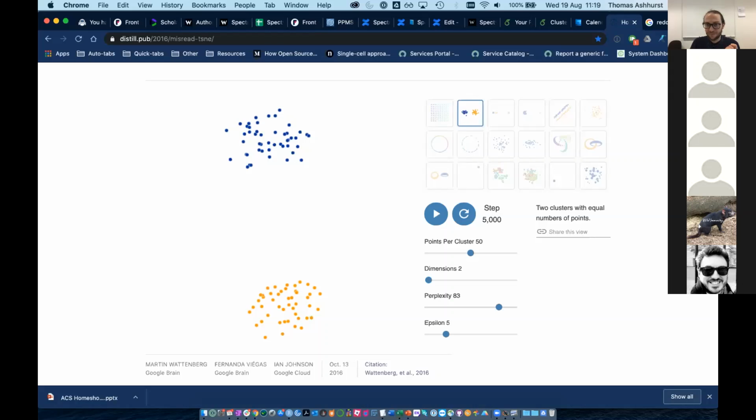I think best practice is you decide, aim high, 40 metaclusters. I don't know, it depends on what you're analyzing, but aim high and then make decisions about that output, I think is the sensible way to go.